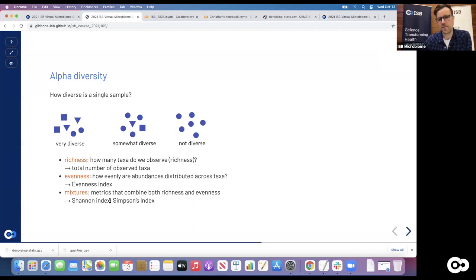We don't really have to go into the detail of how you calculate it, but basically the Shannon index is a quantification of how surprised you would be if you randomly take organisms from that environment. So in that first environment, I might get that rectangular organism, then a circular one, and then a triangular one, because they're all evenly probable. So I would be pretty surprised every time I draw an organism.